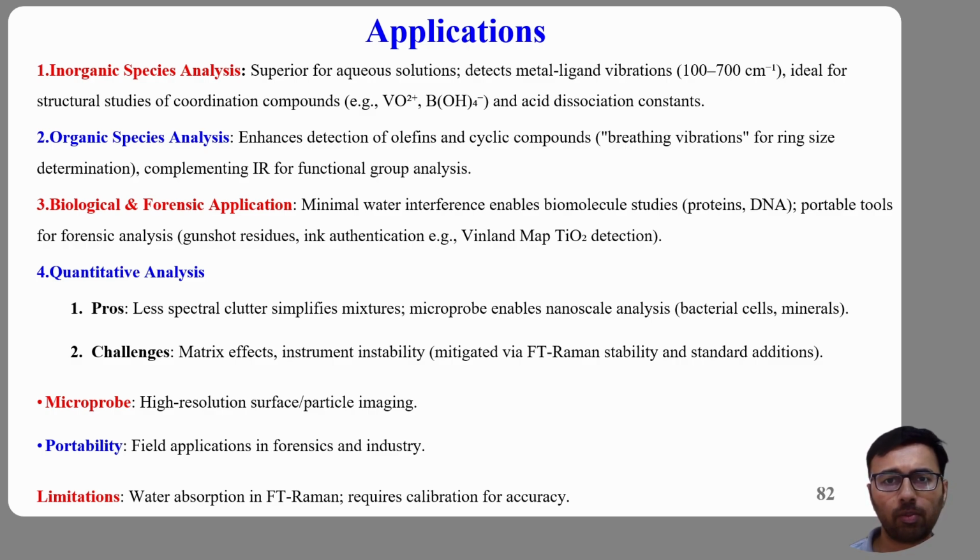In biology, Raman spectroscopy is used to study proteins, DNA, lipids, cells, tissues, and disease markers. Researchers are developing Raman techniques for cancer diagnostics, live cell imaging, and medical biosensing. The pharmaceutical industry uses Raman spectroscopy for drug verification, polymorph identification, tablet analysis, and process monitoring. Because Raman spectroscopy can analyze materials directly through packaging, it is ideal for rapid quality control.